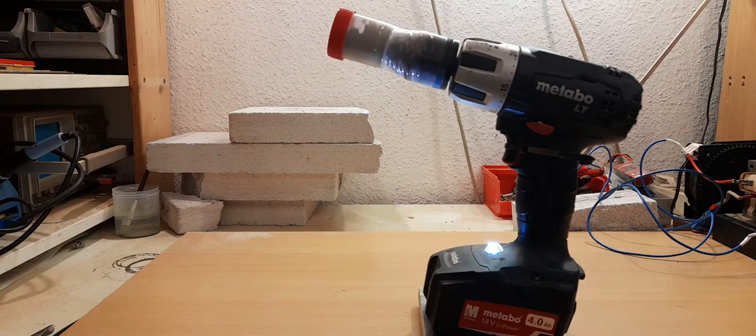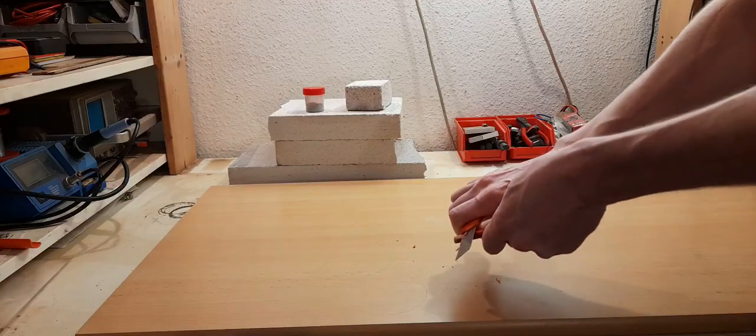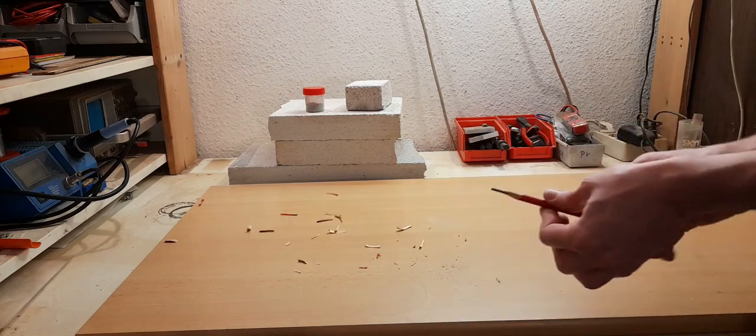While the oxides are mixing we are preparing some high temperature electrodes for our furnace. We need a material that can survive high temperatures. For my first run I tried using graphite electrodes that I collected from pencils.